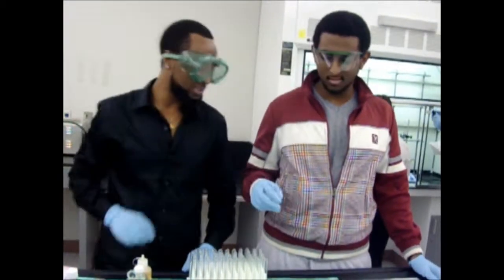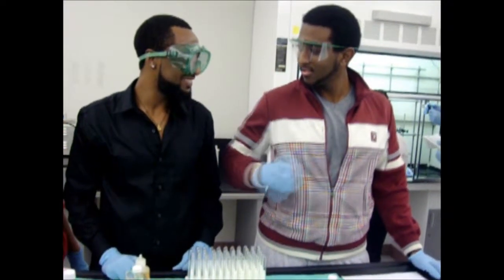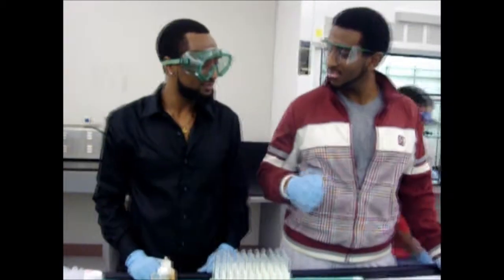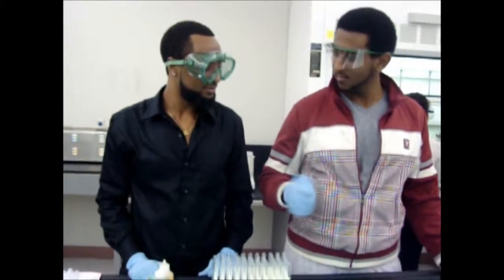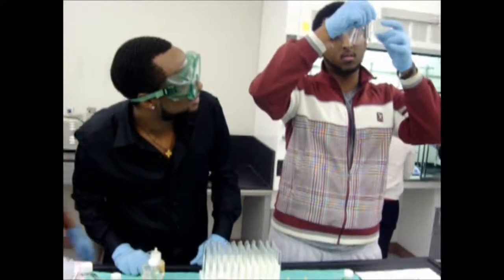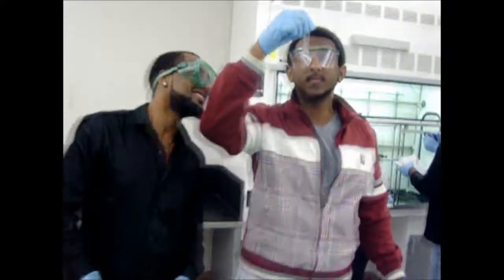Can you do a little bit of mixing? No problem. Let's do the next one. There you go. So, do we see any results here? No. Nothing visible. So it is a negative test.